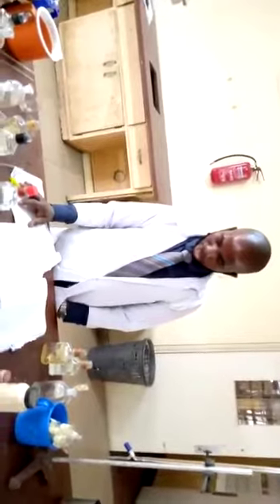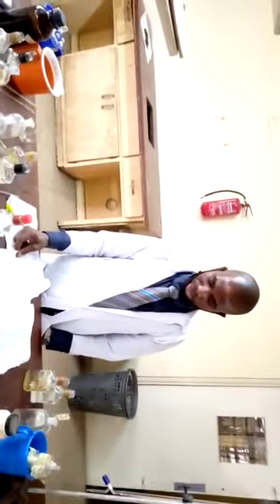What is the color we expect when we are testing with ninhydrin on some protein samples or on some amino acids? We expect a blue or purple color when we are testing using ninhydrin reagent. This we are going to do, and we are going to see it in a while. We also have what is called the biuret test. The biuret test is specific for proteins such as L-albumin, casein, etc. In a while, we're going to see how that is done.